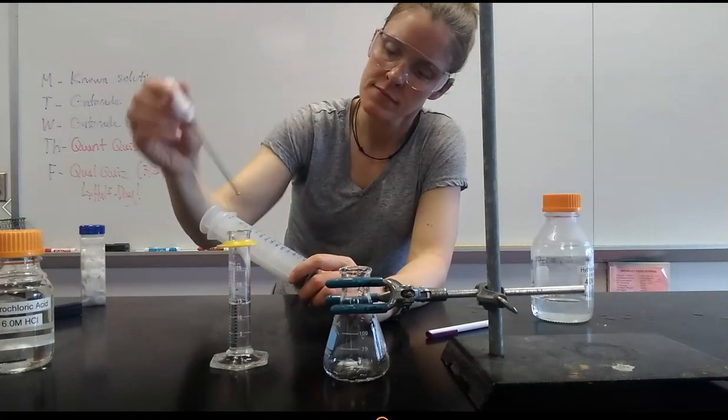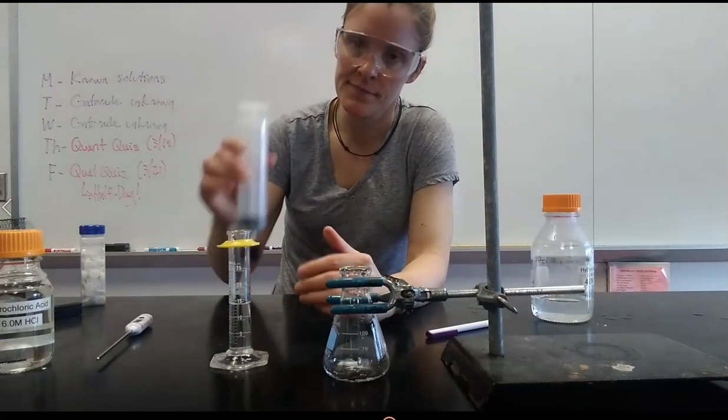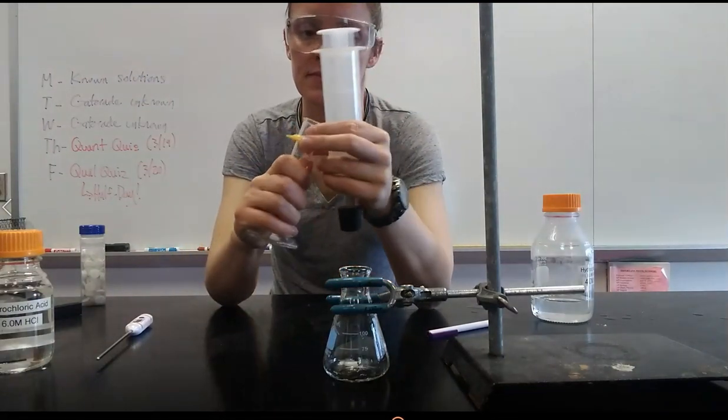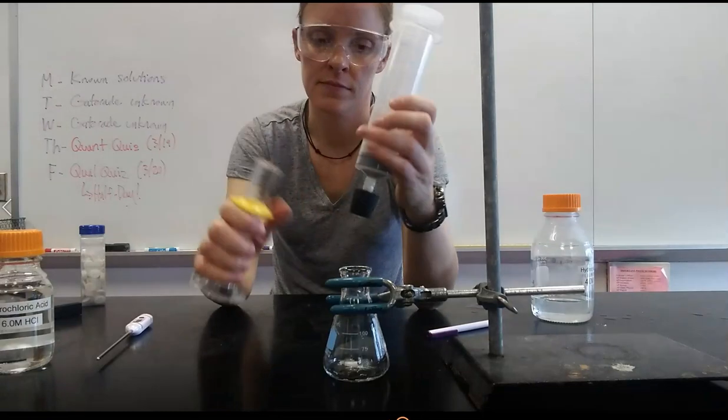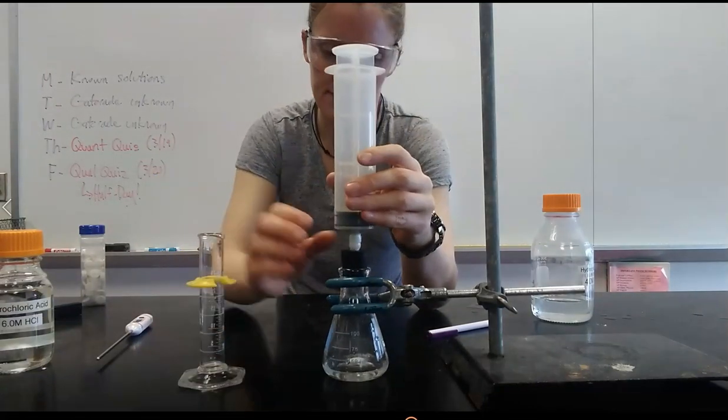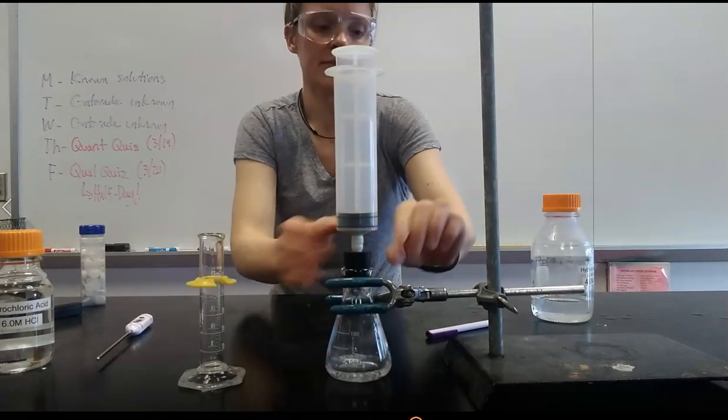I've given my temperature a chance to equilibrate. I'm going to quickly pour my acid and then put the syringe on top of it. You might want to put the acid in there first and then get the tablet in. I'm going to secure it. This is time zero.